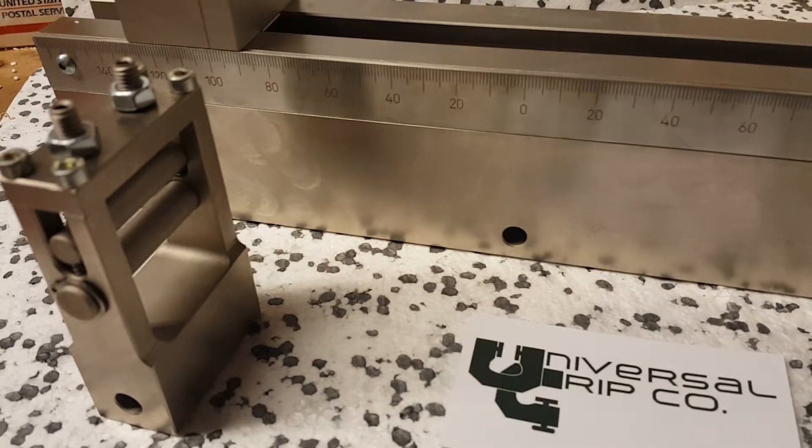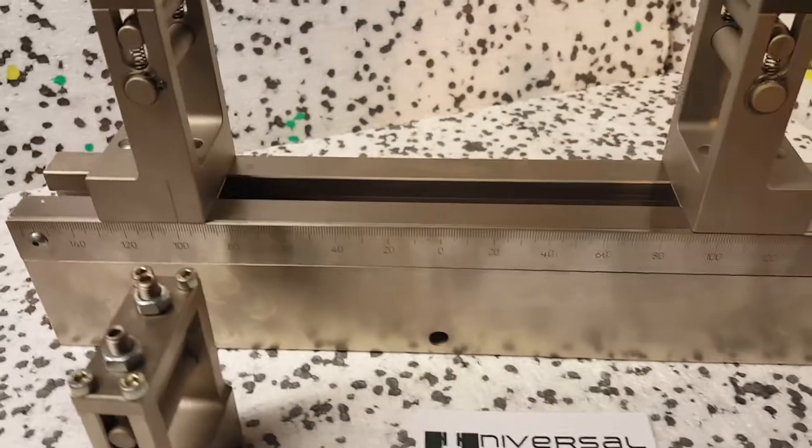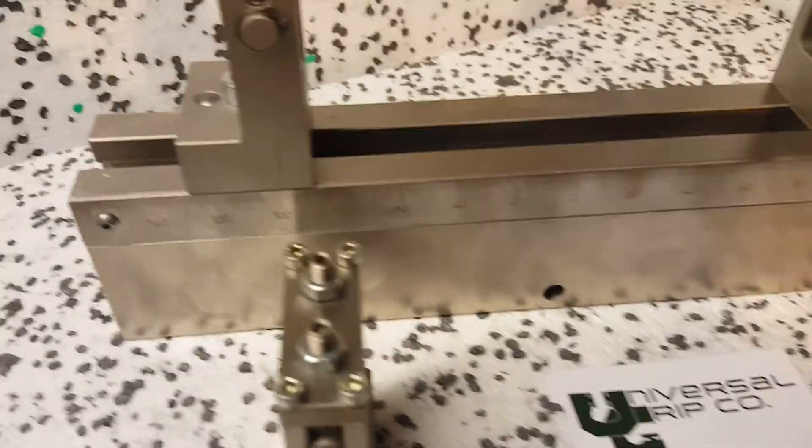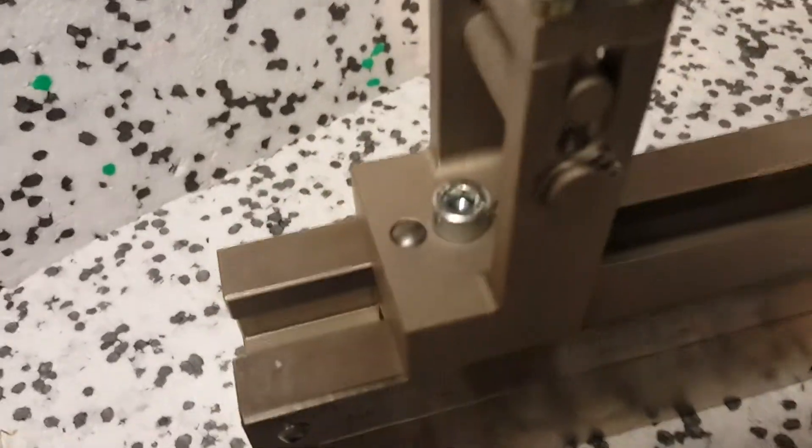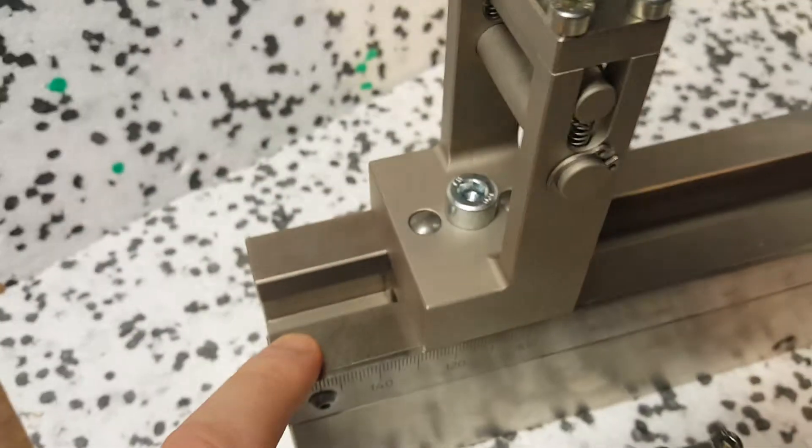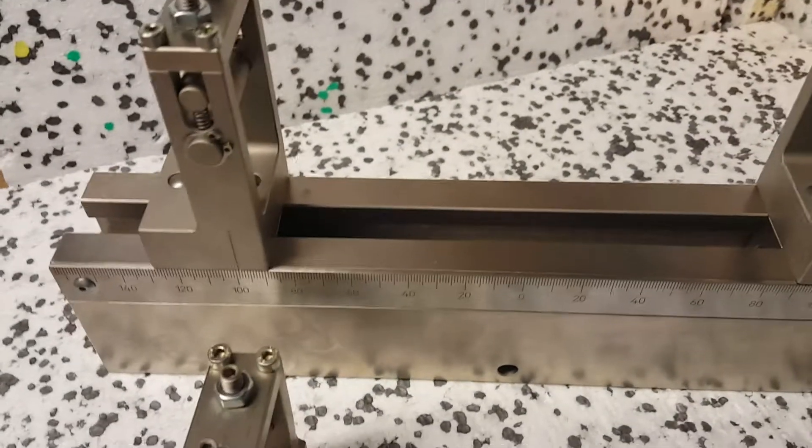There's a couple nice features about it. The first is this gauge in the front, it's in millimeters, so it'll help you line up the supports which are adjustable. You see this T-slot rail here, and then the screw. You can loosen this screw and then slide the supports back and forth to adjust your span length.